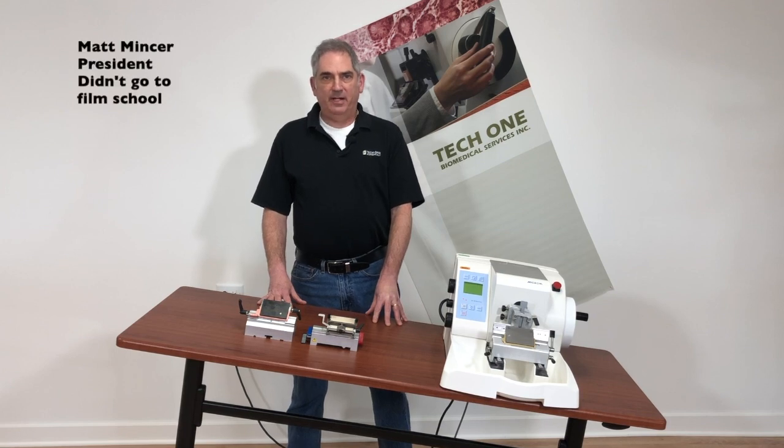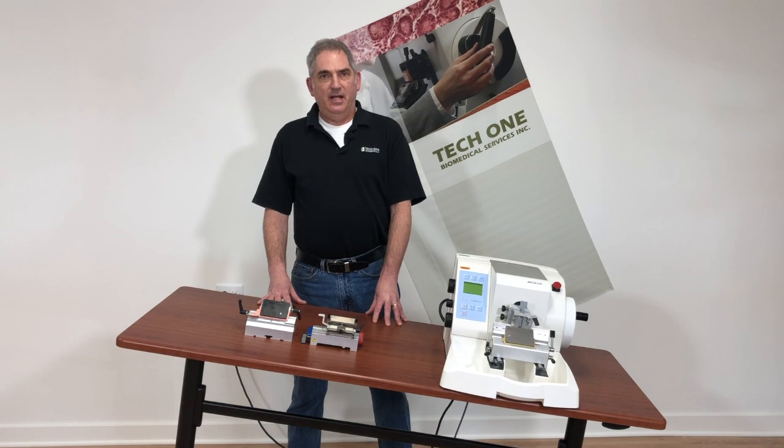Hey guys, it's Matt from TechOne Biomedical Services. Today's video is going to be about knife angles. It's also going to be the first in our series of videos on microtome and cryostat maintenance. If that's something you think you'd be interested in, please stick around.